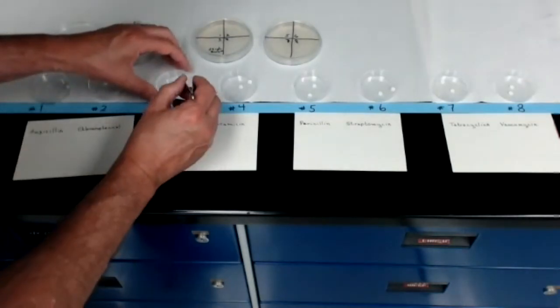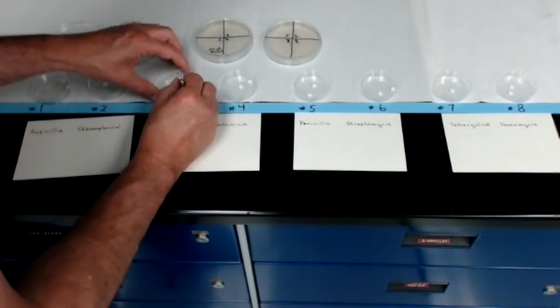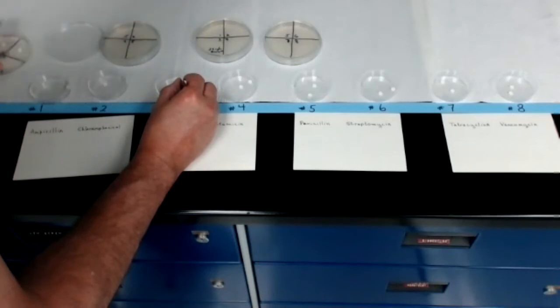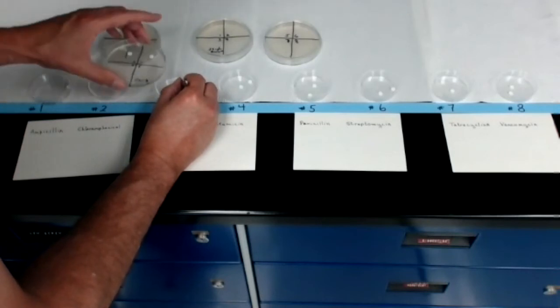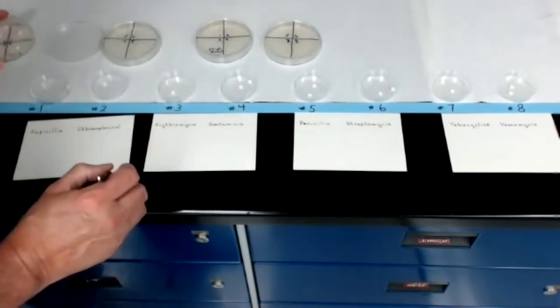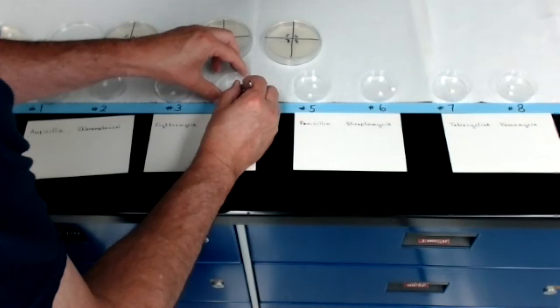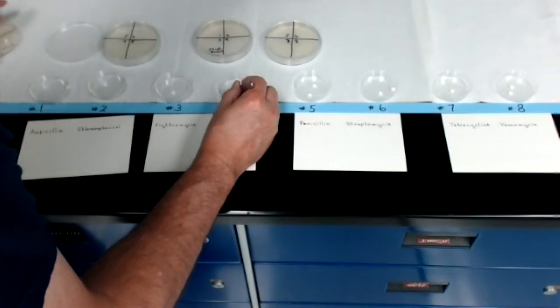I'll now take a disc from the number 3 dish, in other words, an erythromycin disc, and that will go on the number 3 quadrant. And then finally, the last disc that will go on the first plate of E. coli will be a number 4 disc. Pick that up.